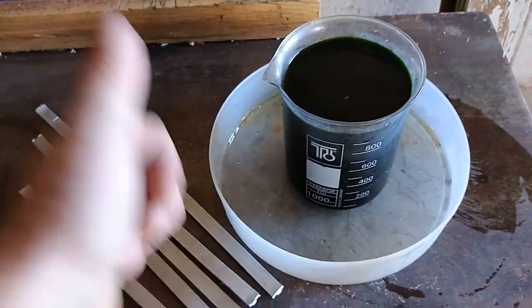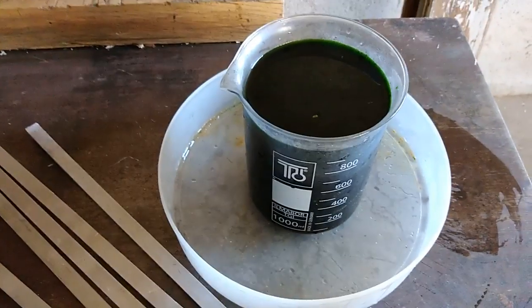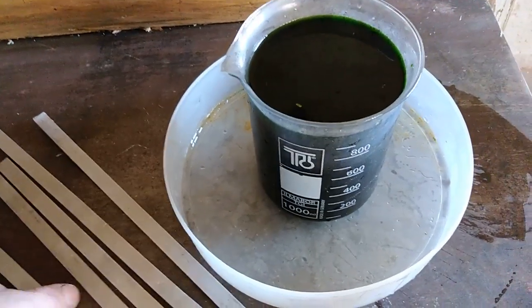Hey guys, what's up? Friend Dusan here. Today we have a video about cementation of copper from old solution with aluminum.